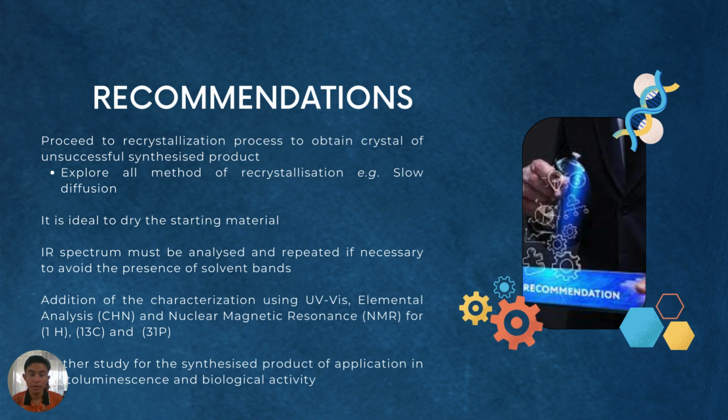And the third one, in addition, we can characterize the complexes even if they are not crystals with UV-Vis, elemental analysis, and also NMR. And then I think lastly, we can further our study of the synthesized product in the form of its application in photoluminescence and also biological activities.